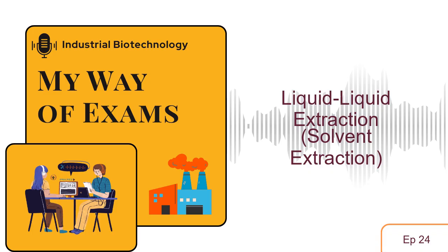Right. So you've got your solvent, and it grabs all the good stuff. How do you get the solvent back to use again and get your purified product? You've hit on a crucial point. Recovery efficiency is key for cost and sustainability. Distillation is common for volatile solvents that evaporate easily. You can also use evaporation, or use gas or steam to strip the solvent away. Or there's adsorption, where you use something like activated carbon to capture it. And then there's membrane separation and even back extraction, where you transfer your precious solute back to another liquid. Lots of options.